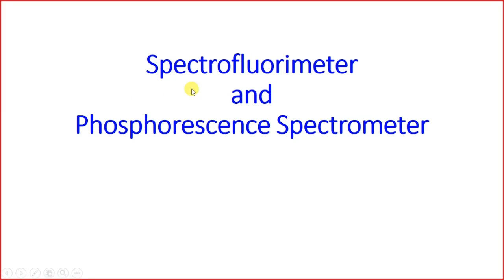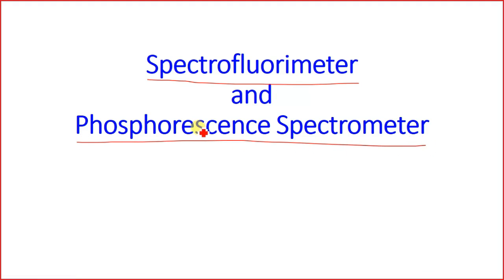Good evening, everyone. Today we will start with spectrofluorimeter and phosphorescence spectrometer. Okay. So the word spectro comes from the word spectrum. This fluori comes from the word fluorescence, and meter is the device which is used for the measurement purposes, right?